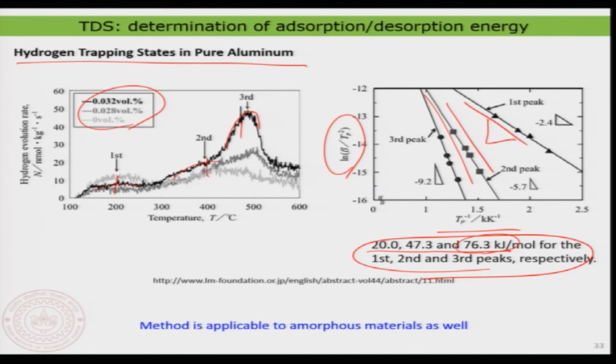So, using thermal desorption spectroscopy you can now determine the desorption energy, and therefore the adsorption energy, and you can determine whether the processes are first order or second order. You can also determine the types of sites that are present. You can also determine the different types of adlayer patterns that you form and so on. So, this is a very powerful technique which is commonly used in understanding the energetics of the adsorbate layer on the surface. With this I conclude.